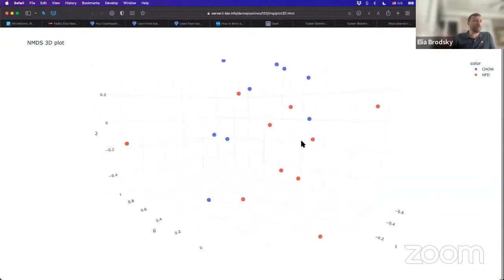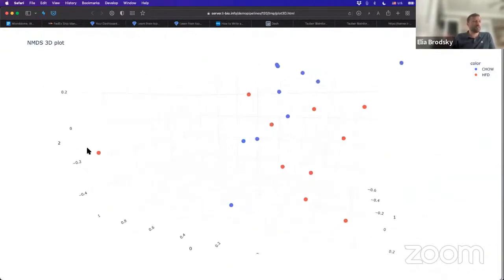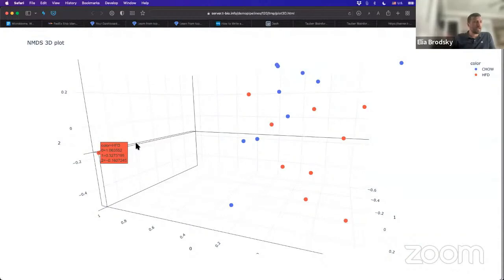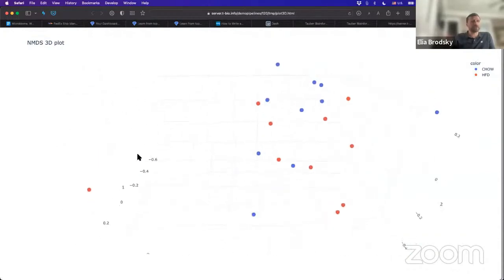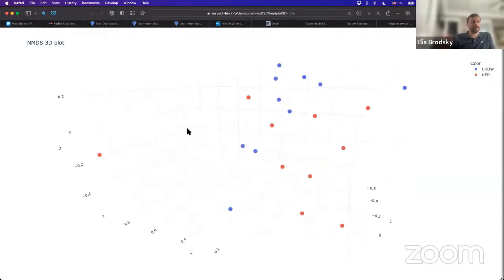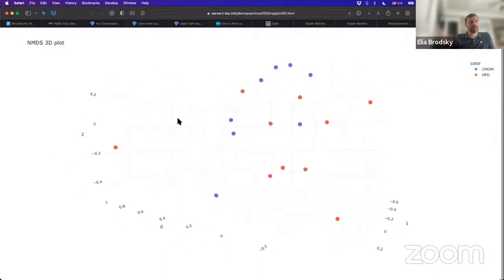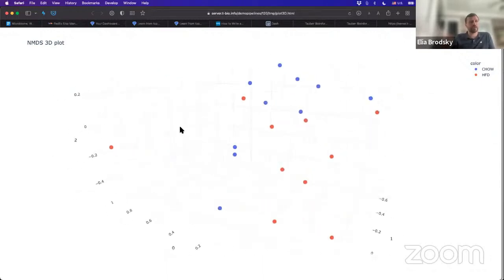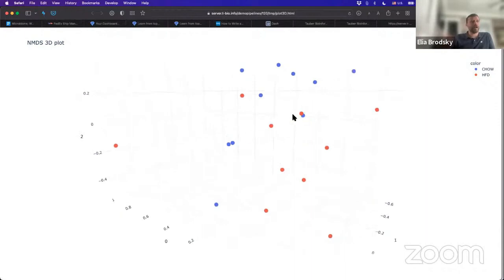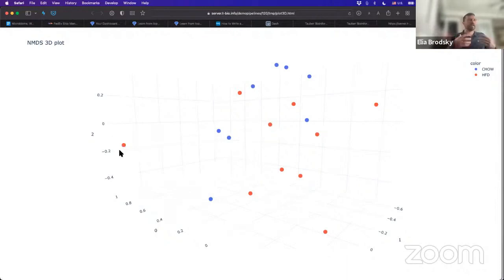As we look around, we can notice 2 major things. The first one is that we have an outlier. And the second one is that if we removed the outlier, we would be able to see pretty good separation between our samples. If we find a way to position this plot, we could find a line that could separate the dots. Of course, that is dependent on removing this outlier. And that is really the essence of this type of analysis that we will go through in the full program.